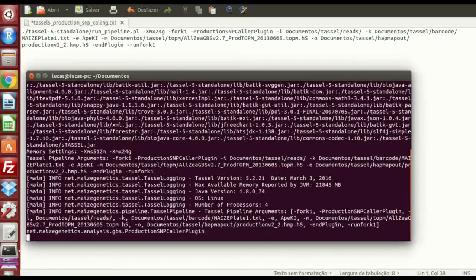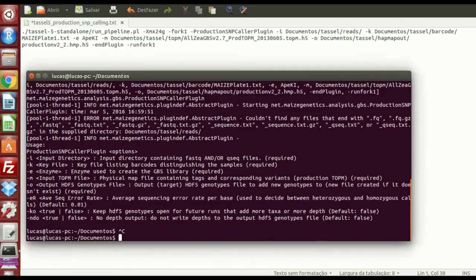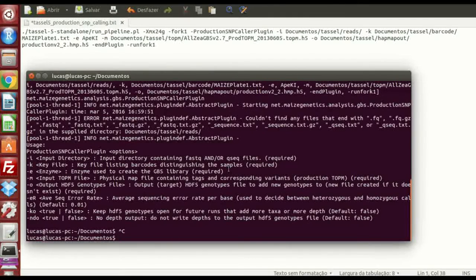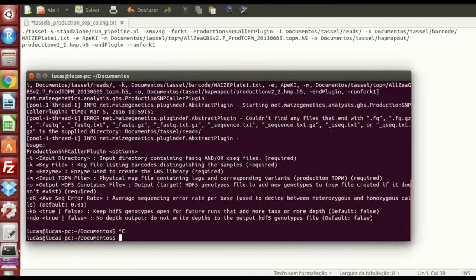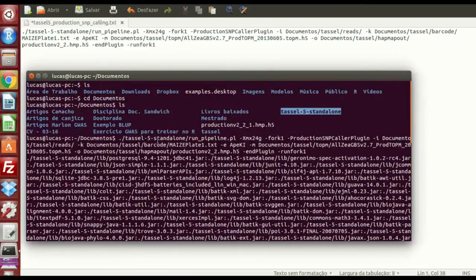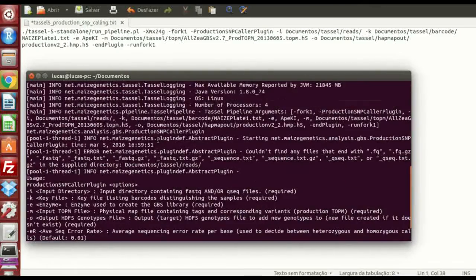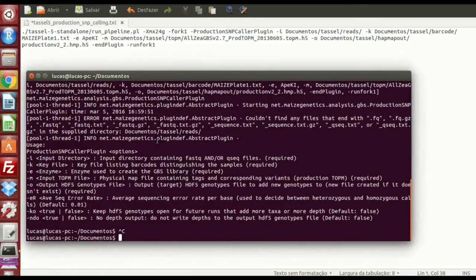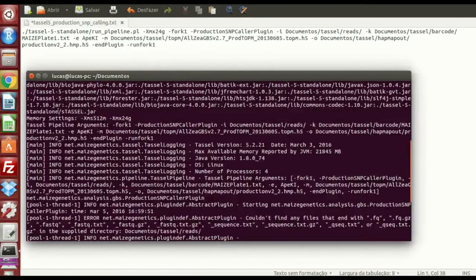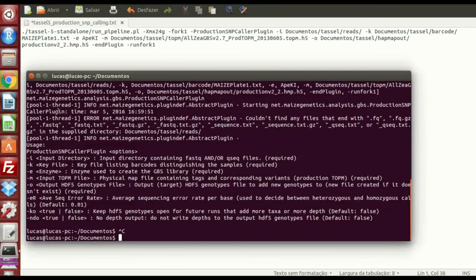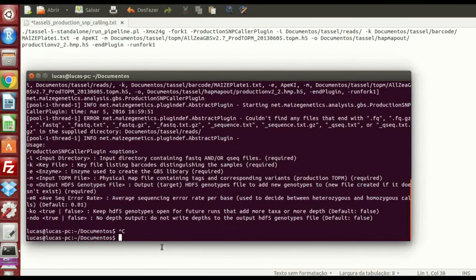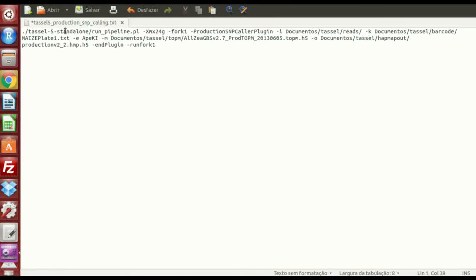So I can run the pipeline right now. I'm going to cancel because I don't want to get in trouble here. Because my computer is not good enough to run this. I'm just making this tutorial in a 4GB computer. But I made this analysis in 32GB of RAM. And it took one or two hours to run. So it takes a while even if it's a good computer.